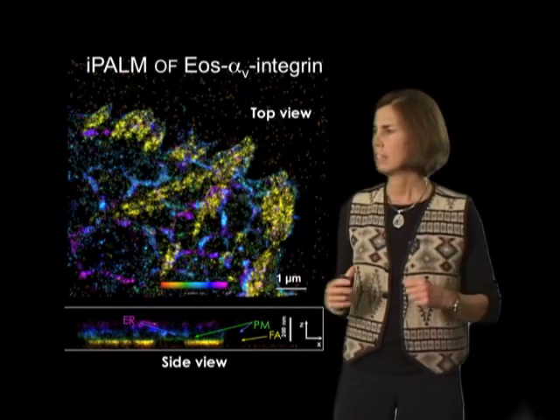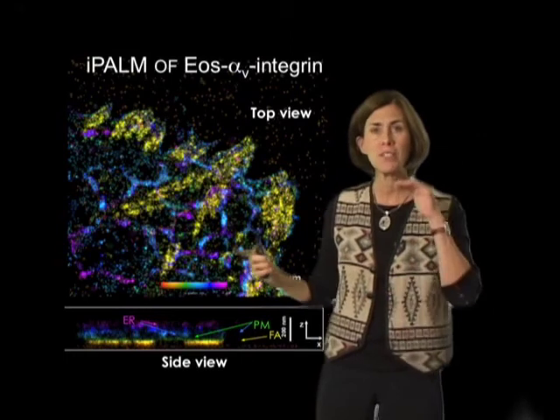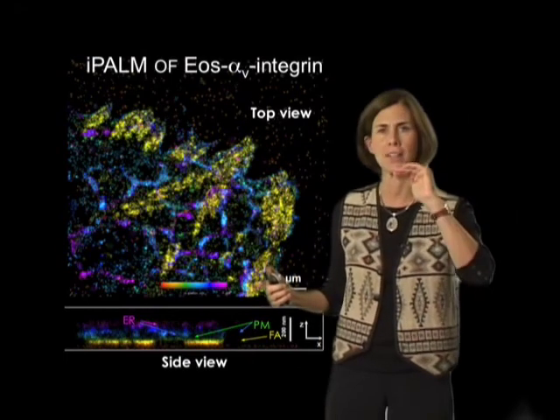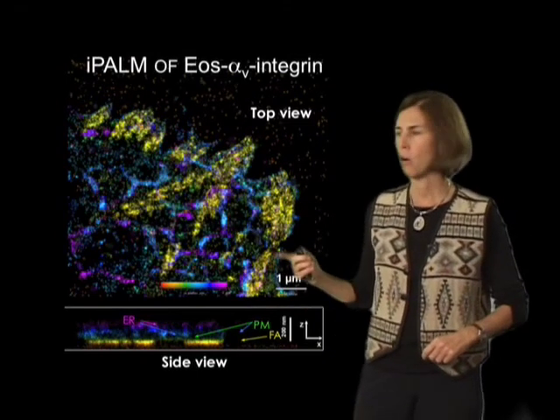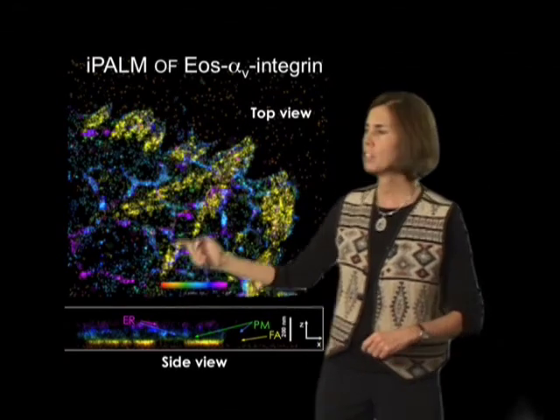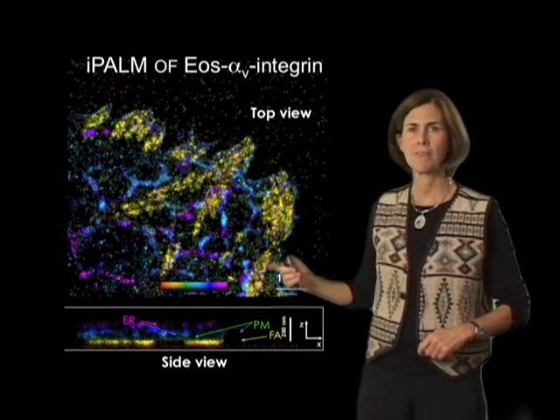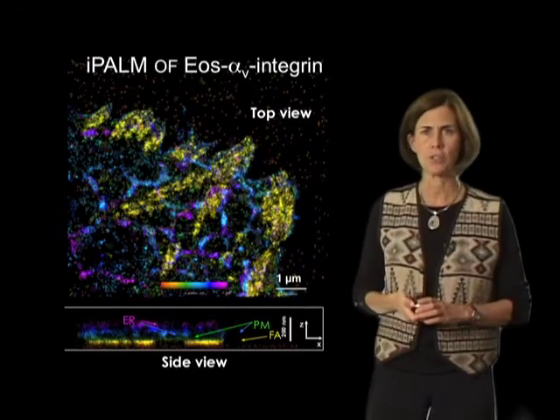The reason is that these molecules are within the endoplasmic reticulum, which is positioned at about 225 nanometers off the surface of cells. The molecules that are color-coded yellow are simply the ones positioned close to the cover slip, and you can see all of those molecules are associated in structures that have the characteristic morphology of focal adhesions.